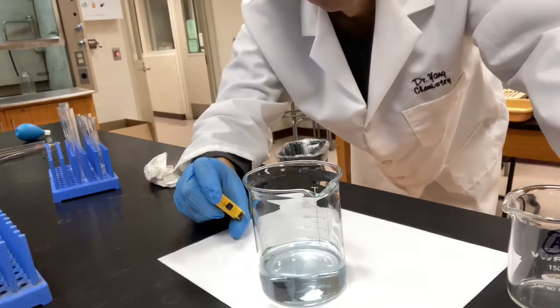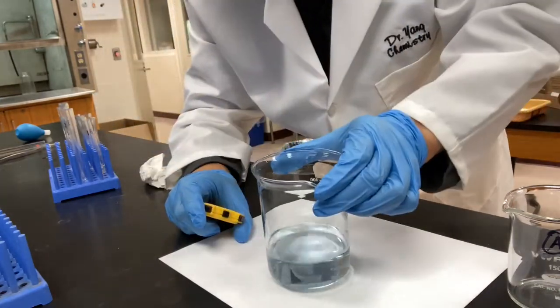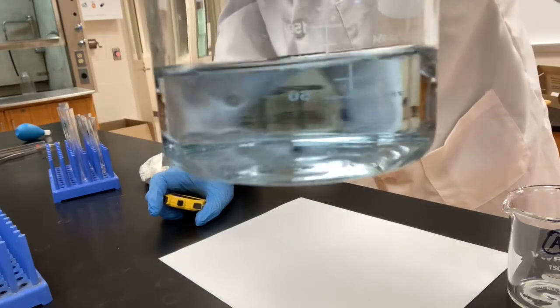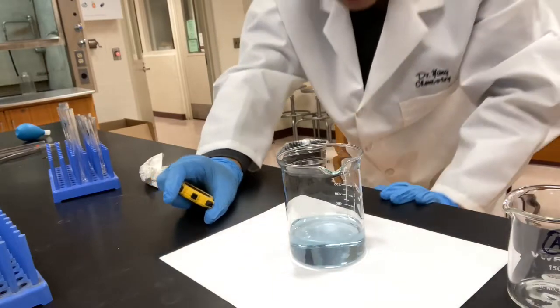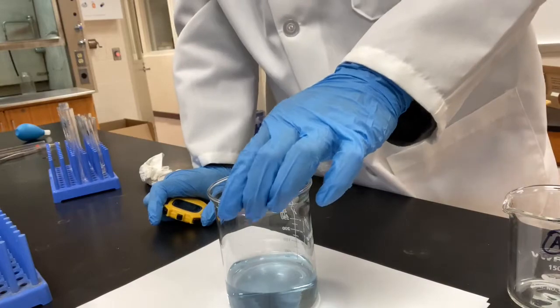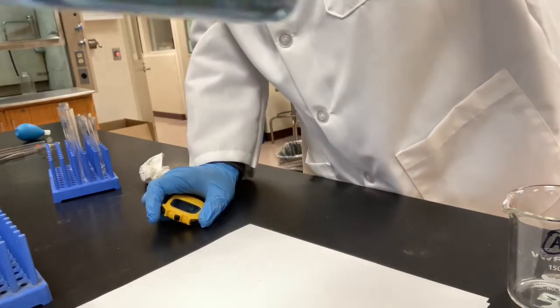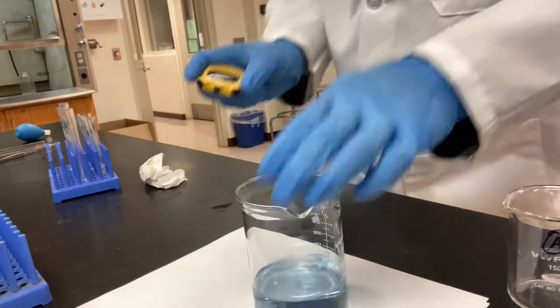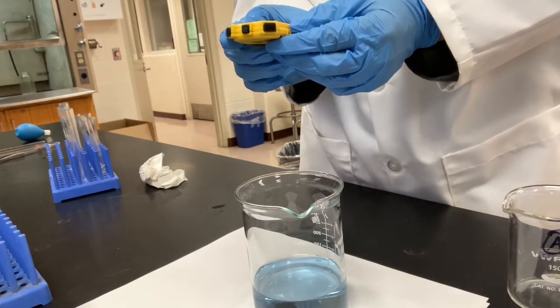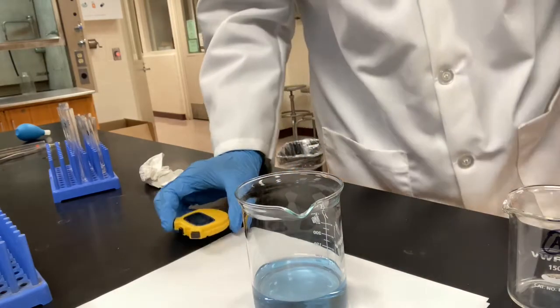Yep, I see blue. It's going to get darker and darker. Again, when I see blue, I stop. I don't want to wait. It gets darker so that it becomes harder to predict what kind of blue it is. All right, it took 8 minutes 44 seconds for trial 1.